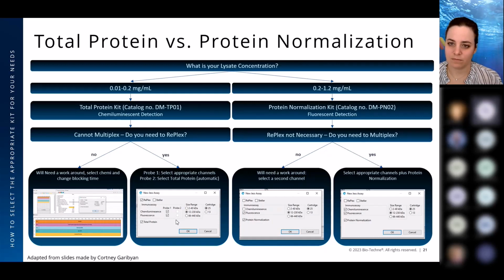Yeah, that's exactly what we're doing. It works actually for the normalization with the algorithm using reference capillary number 2, provided that all the samples are the same and you just use reference capillary number 2. And you're looking for the one with the highest area of total protein, right? Not highest, it would be the average area, right? The average area. Okay. Looks all across the board the same.